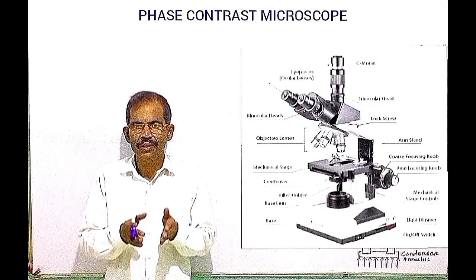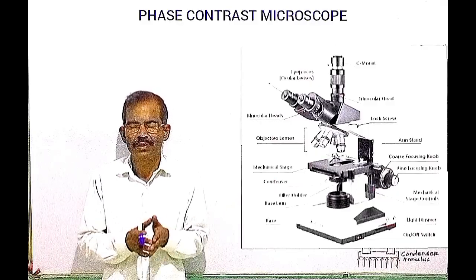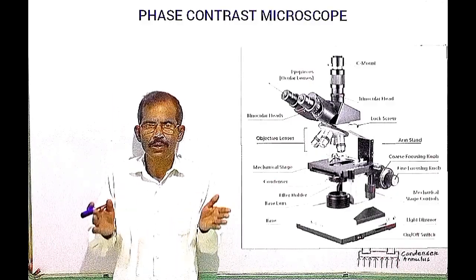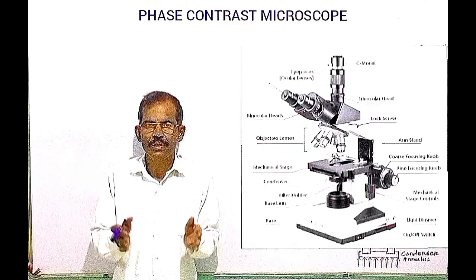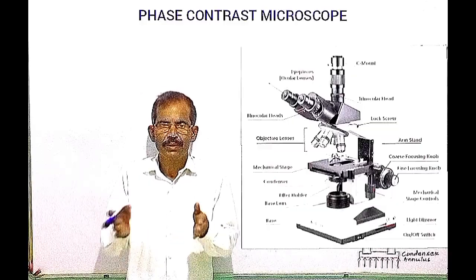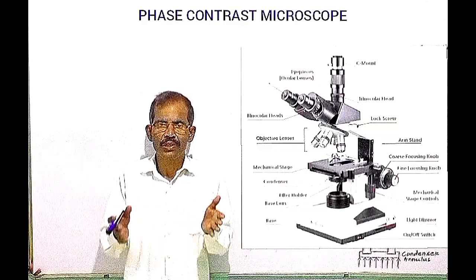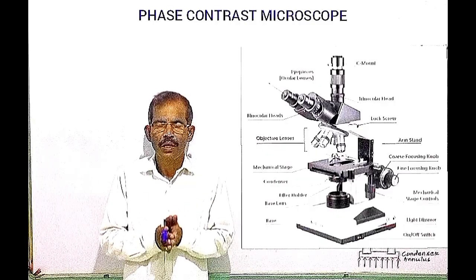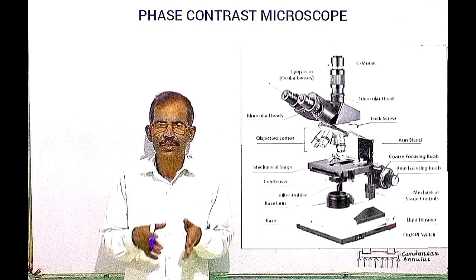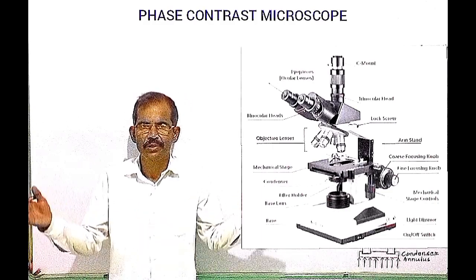In addition, it is used to examine internal cellular components such as membrane, nucleus, mitochondria, spindles, mitotic apparatus, and chromosomes. This methodology is also employed to diagnose tumor cells, growth, and to study the behavior and dynamics of cells and tissues from both plants and animals in culture.